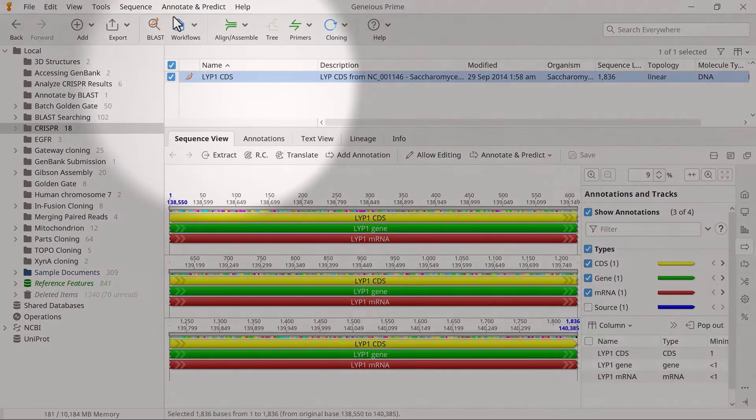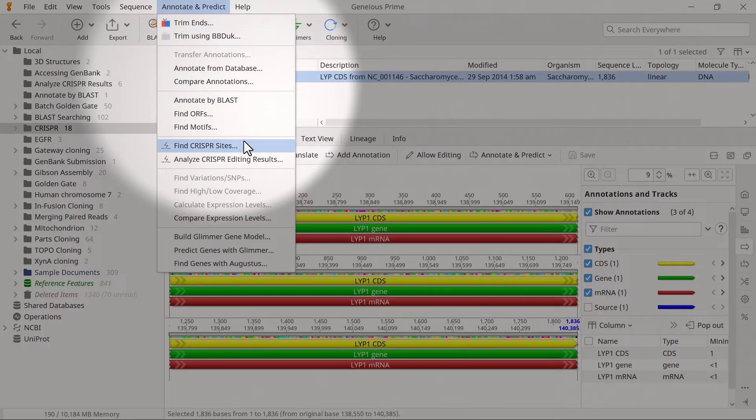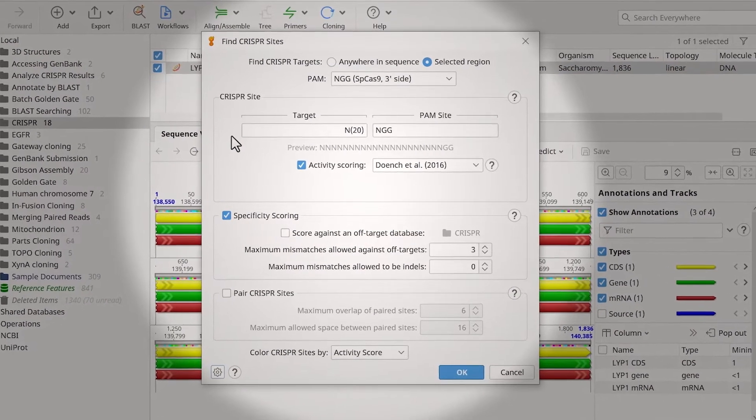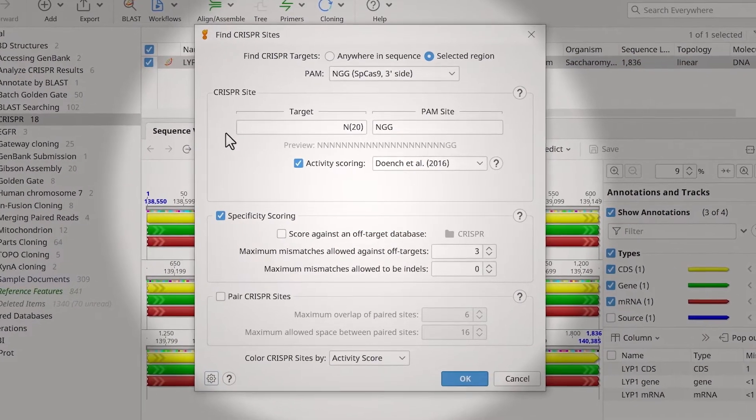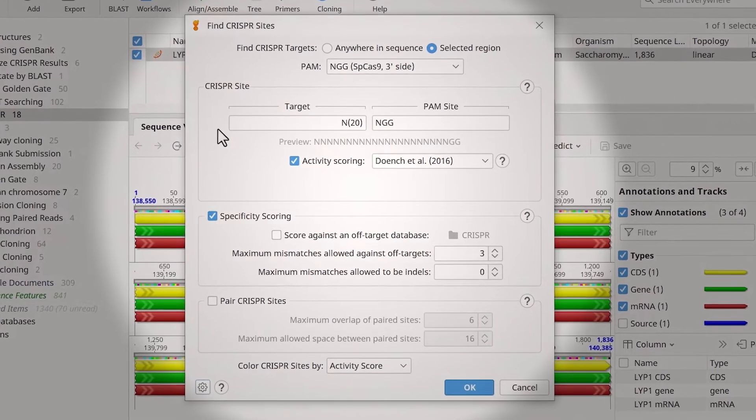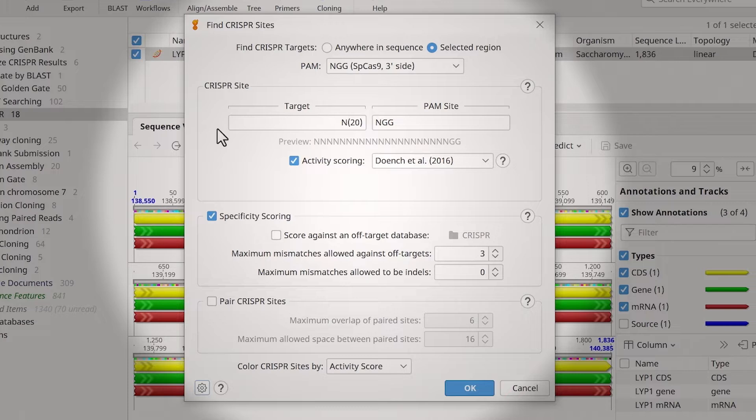Go to Annotate and Predict and click Find CRISPR sites. You can choose to search anywhere in the sequence or within a selected region by highlighting the area of interest before opening the tool. For this example, I will search anywhere in the sequence.